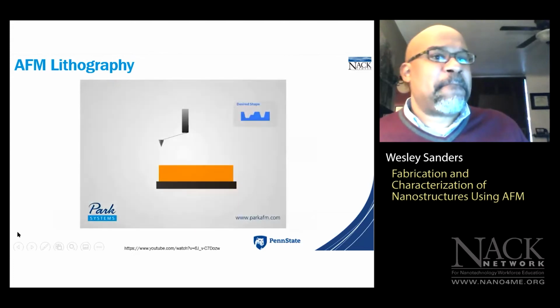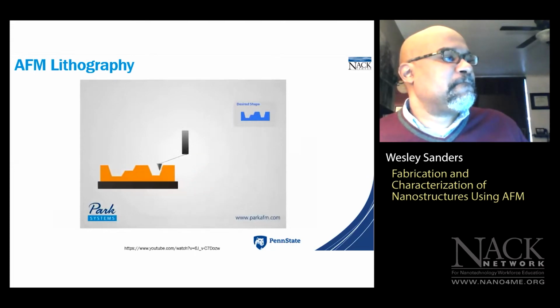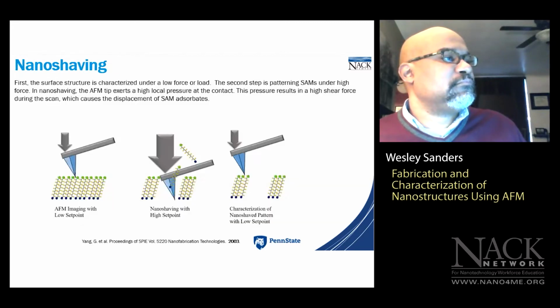Nanolithography. Here, the cantilever is used to intentionally modify the sample surface via mechanical and/or electrical means. To mechanically alter a surface, a specialized robust cantilever gouges the surface with excessive force. To electrically alter a surface, a cantilever with a high bias is used to oxidize local surface regions.